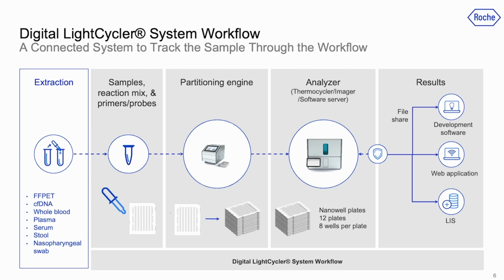What happens is that these particular samples are inputted and associated with the consumable. As I mentioned, the consumable itself has a barcode that's attached to each plate. So you can imagine that association occurs via the web application, and therefore, at the outset, you already have sample tracking occurring. Next, the extracted samples are combined with the digital PCR mix, primers and probes, and then pipetted into the actual nanowell plate based on the assignment that's been given by the web application.